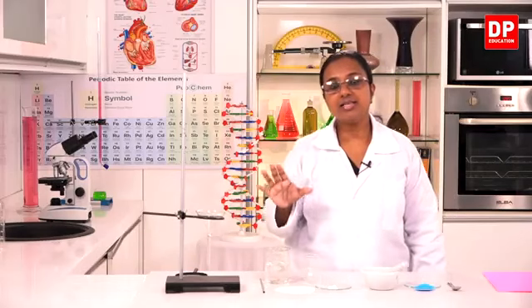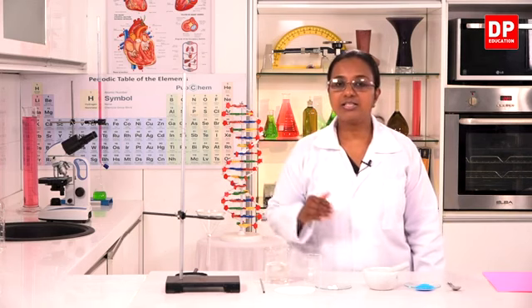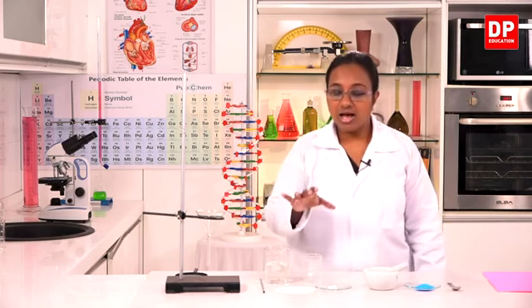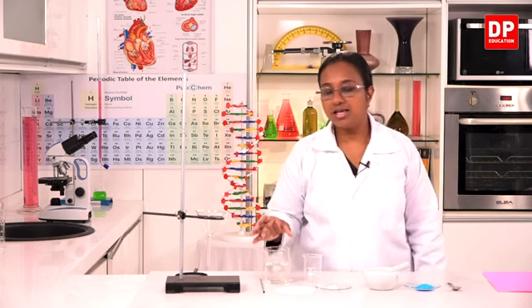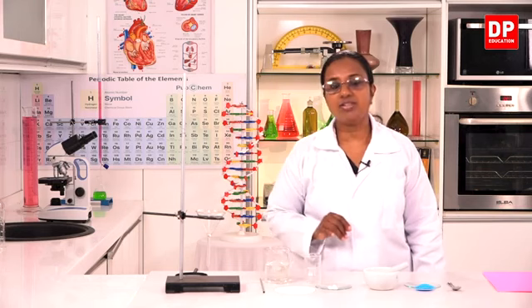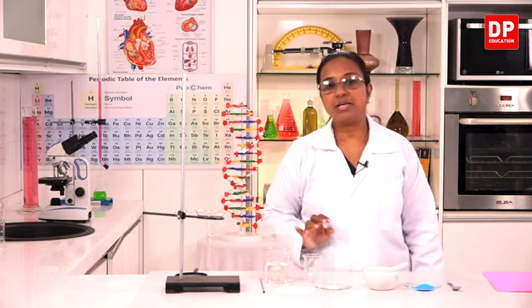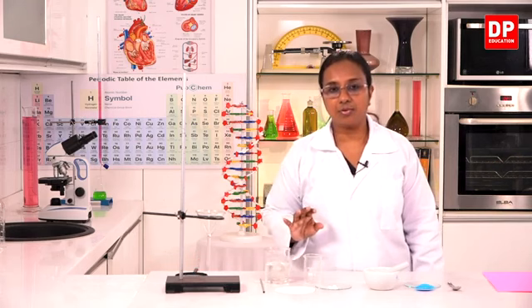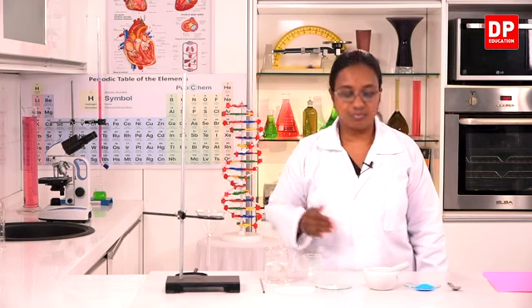Then again, since I am going to do both activities together, the first and the second activities, I have a beaker to which I will be transferring the substance and I have water to dissolve the mixture. And later to filter the mixture to separate the components or to observe whether we can separate the components.